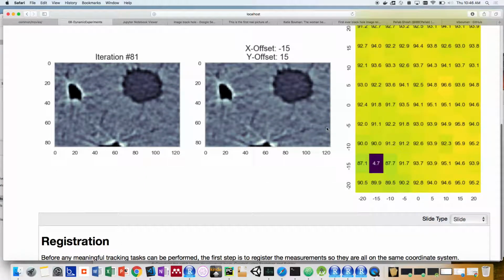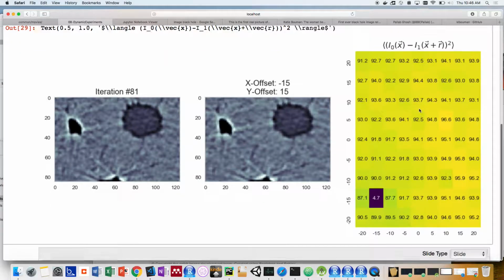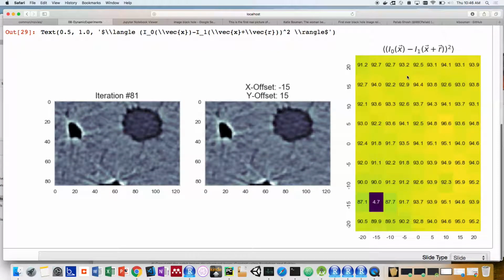Yeah? So this is something like a convolution map on the right, and then a convolution and some additional analysis like RMS or average. Right, yeah. You're basically just sliding one image over the other. The kernel for the convolution is image 1, and the input is image 0. And then this is just picking whatever metric you do over it. It can be a convolution or any number of different post-processing operators on it.